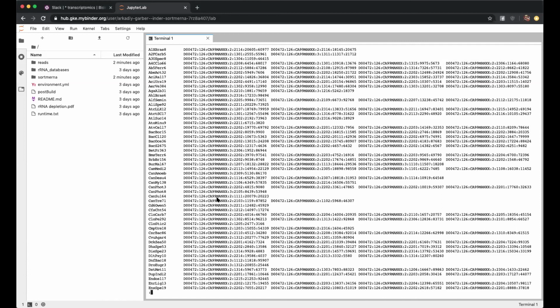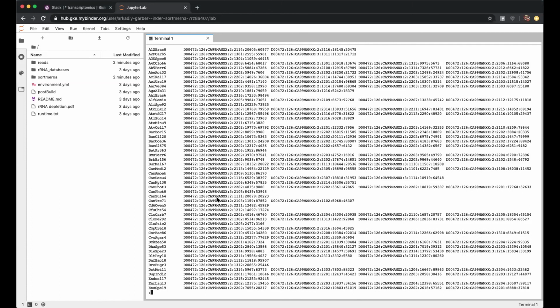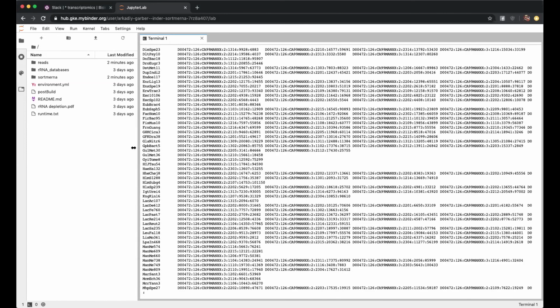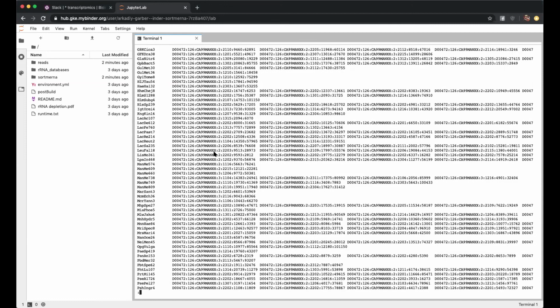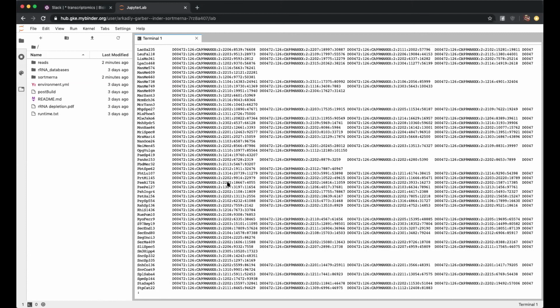So this is basically a closed reference OTU clustering? Yeah, that's what it seems like. But I thought I gave you a table. Maybe they changed it, or maybe I'm misremembering, but it seems like you have to do this yourself, like if you want to count how many reads map to each sequence. And maybe I missed it, but what's the percent ID of OTU clustering here? So there's no clustering actually.